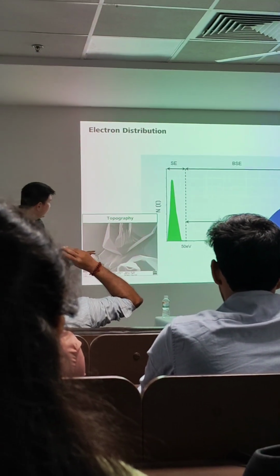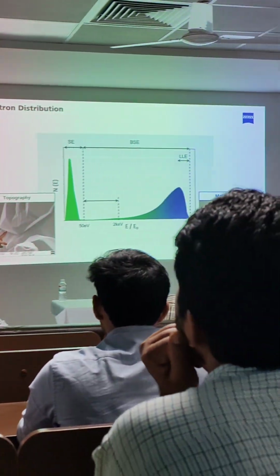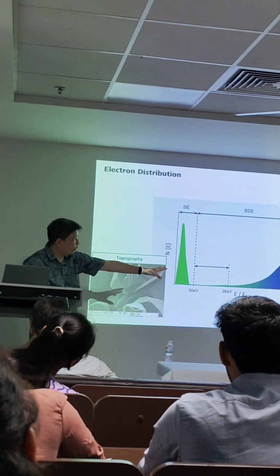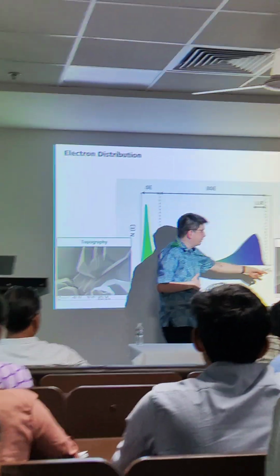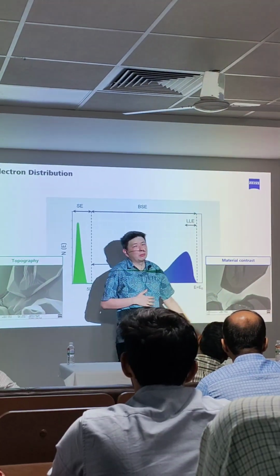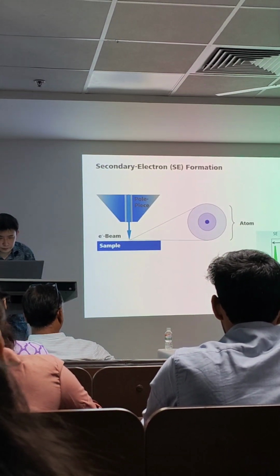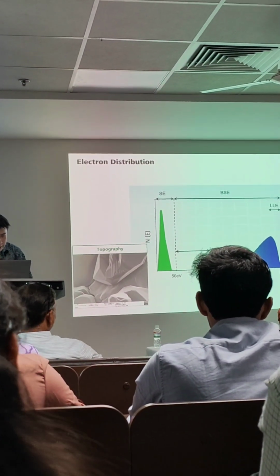Yeah. So when you see topographical, you can sense that some are higher, some are lower, right? That image you cannot see, right? These are actually the same image, but that one they give you the sense that probably this one is the high molecular mass, this is low molecular mass, right? They give you different feeling of the sample. Yeah. Yeah. So that, sorry, was image using the backscatter.